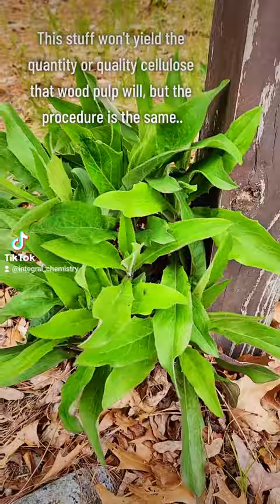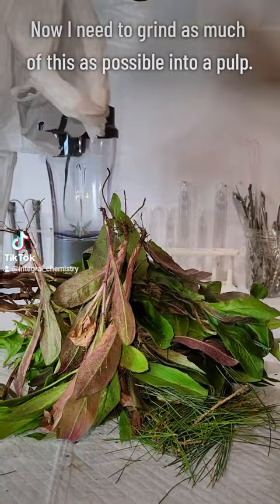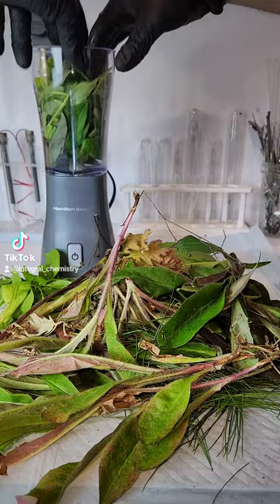I'm going to do this using the same procedure that companies use to make paper from wood pulp, but obviously the quality and quantity of cellulose won't quite be the same. In any case, my first step is to make my plant material into a pulp, and I do this by grinding it down in a blender I got at Walmart. This is a pretty crappy blender, so I try to pick off and use only leaves while leaving behind any roots, stems, dirt, or anything that might damage or destroy the motor.